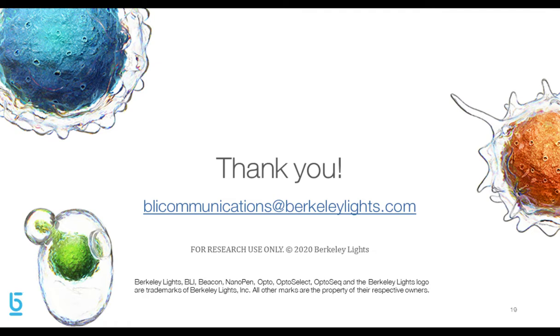Now, do the antibodies change with the mutations of COVID-19? So we've demonstrated that by performing multiple assays with different antigen variants, you can identify antibodies that are specific or cross-reactive against multiple targets. So in this case, if you were screening against different variants of the spike protein in a single experiment, a single workflow, you'd expect to find antibodies, again, that are specific to particular variants and cross-reactive against multiple variants.